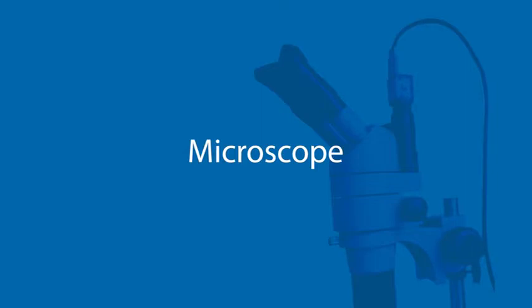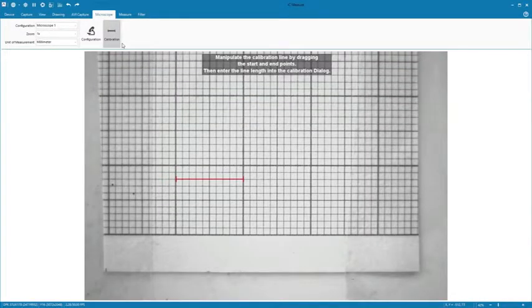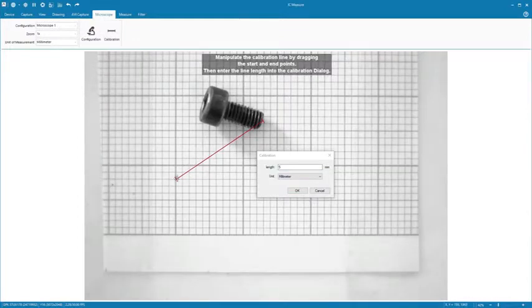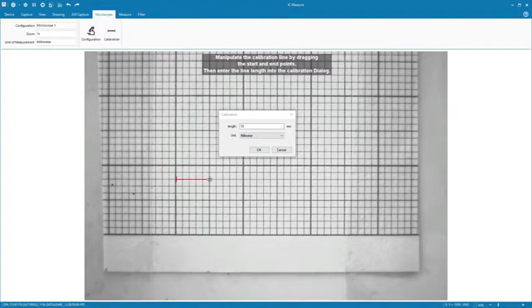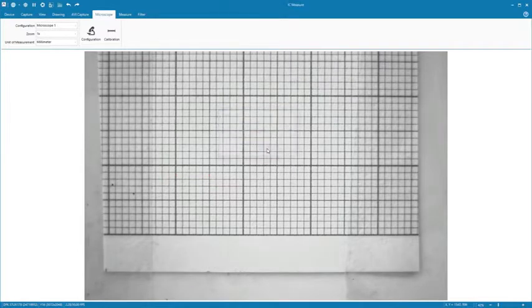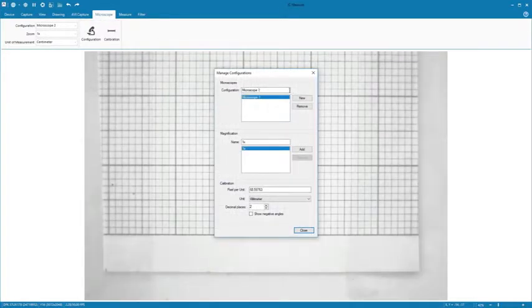Under Microscope, before length and area measurements can be made, you must first calibrate the microscope. A stage micrometer or other object of known length can be used as a reference. Use the mouse to adjust the reference line as appropriate to specify a unit of measurement. You can also define and save multiple microscopes in calibration settings.